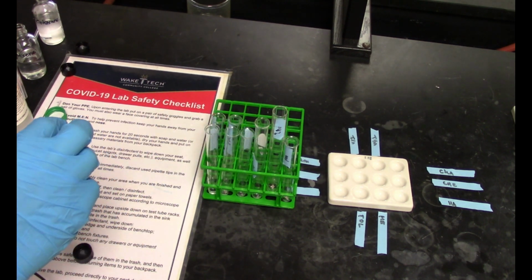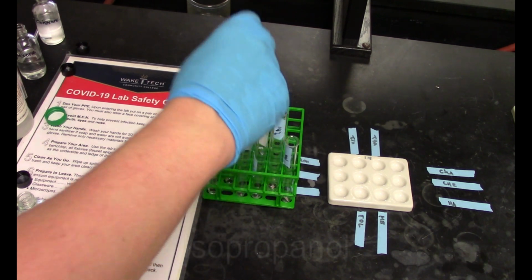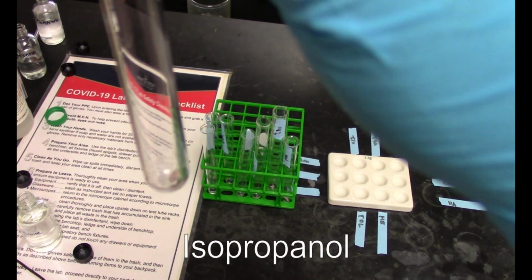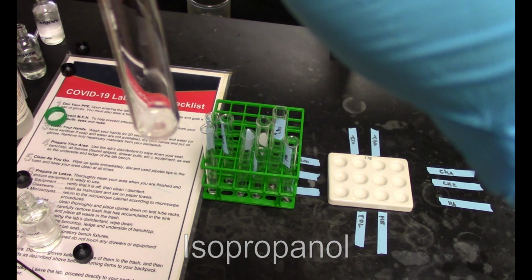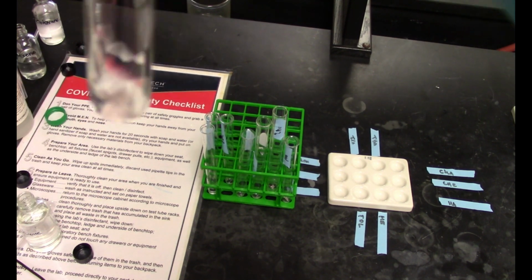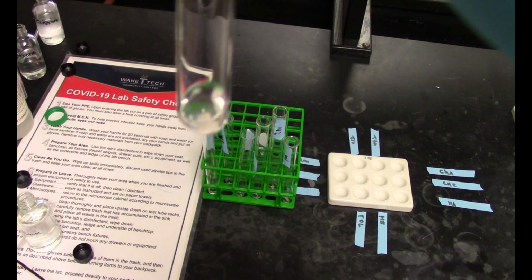Then we go to propanol. So the 2-propanol, and our alcohol, and maybe a little hard to see here, but there's definitely a little stream of bubbles coming off the sodium metal, but it's definitely not nearly as pronounced as we saw with the ethanol. So this is a much slower reaction.